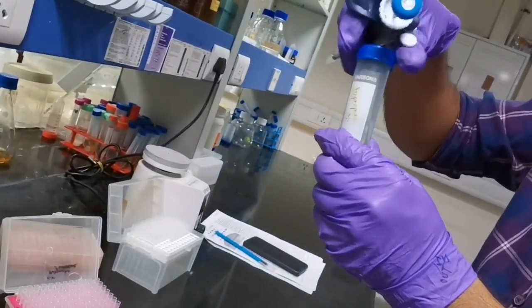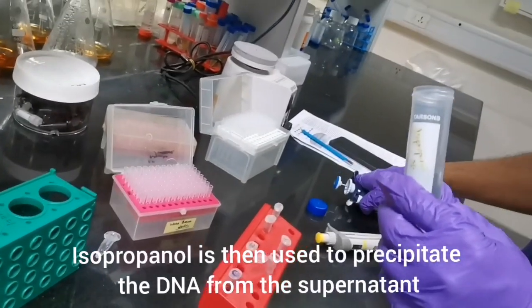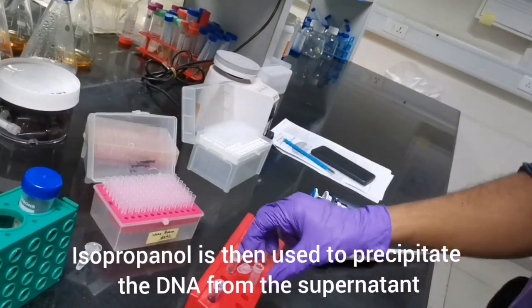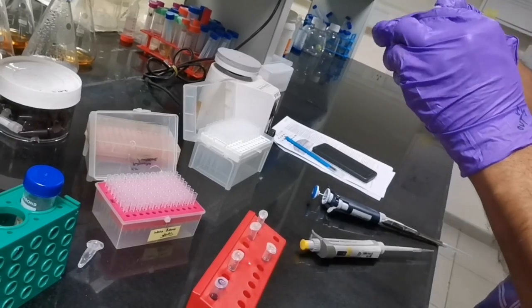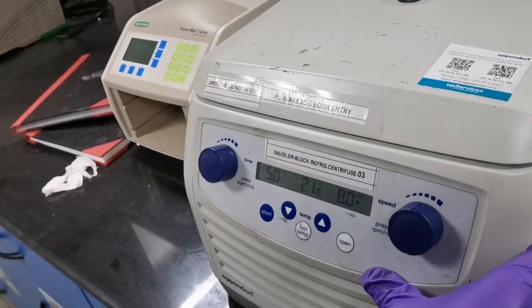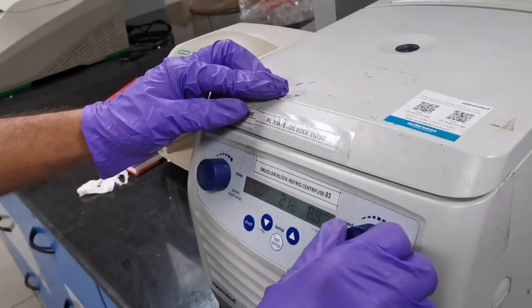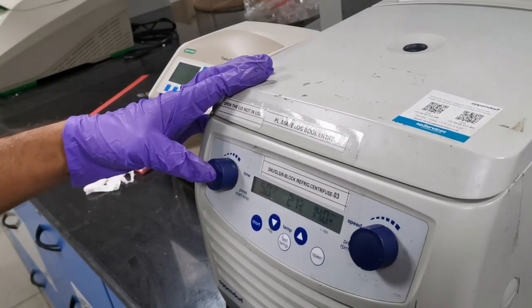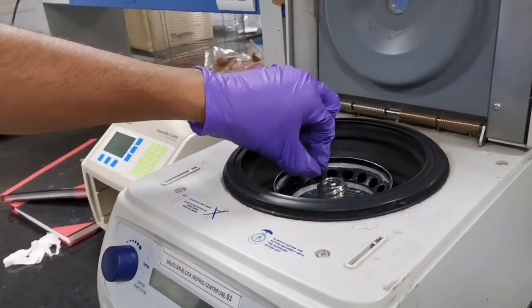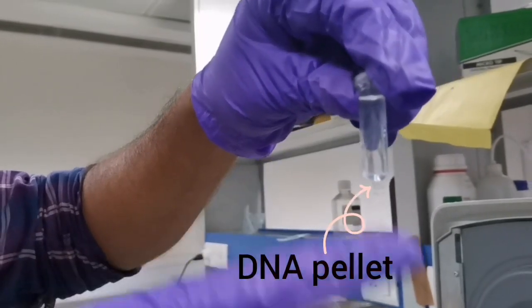This is isopropanol. After half an hour incubation at -20, we are again centrifuging the solution at 14,000 rpm for 5 minutes. So this is the DNA pellet, plasmid DNA pellet, and we have to remove all supernatant, and we'll wash this pellet with 70% ethanol.